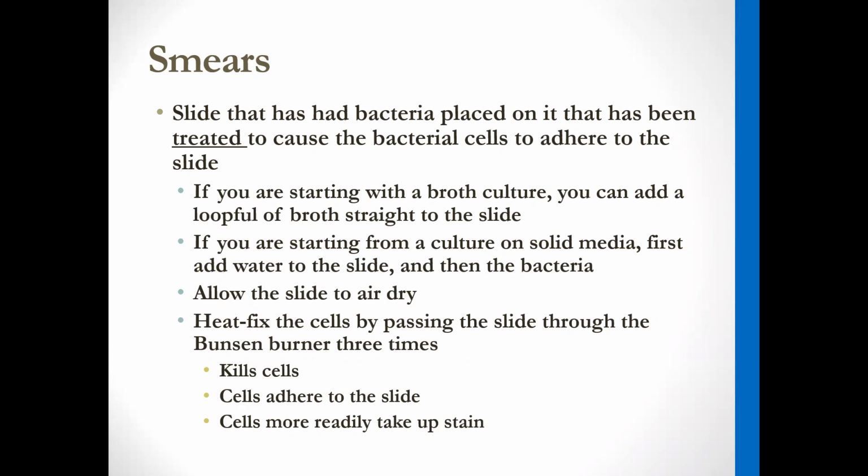onto the microscope slide. Now you're going to want to spread those cells out on the microscope slide because you want to make sure you can view individual cells. If you were to just put a bunch of cells in the same spot, they're going to overlap and be all crunched up against each other, and it's going to be really hard to determine their arrangement. So you want to spread your cells out on that slide, and then you need to let it air dry. And this is the point where it's okay to use little air dryers, which just speeds up the air drying process.